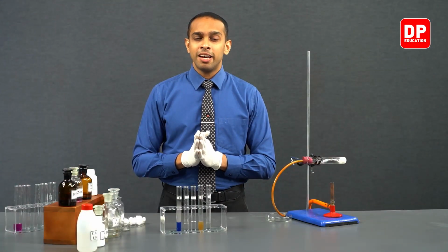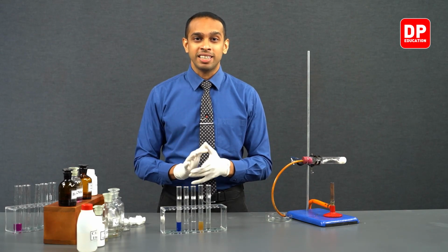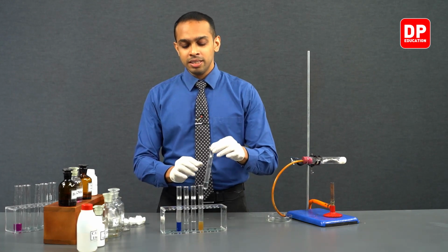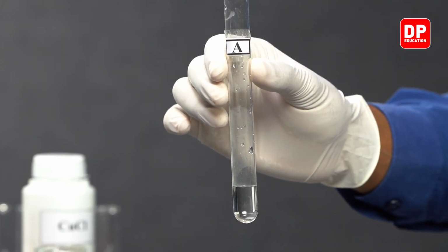Now students, we have conducted the first part of our experiment. Let's take a look at what actually took place in each of these reactions. In our test tube A, we had bromine water.